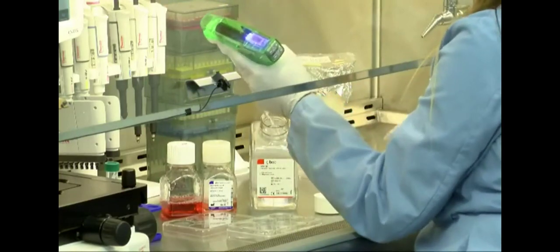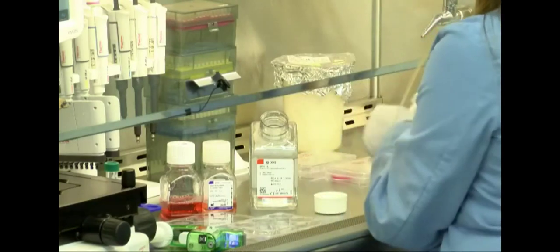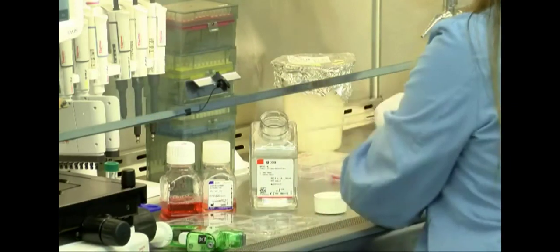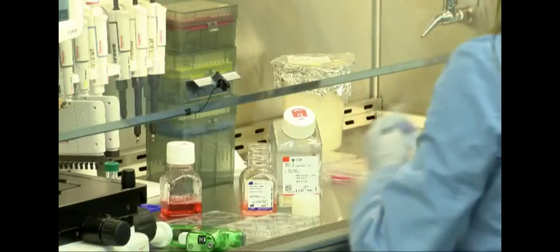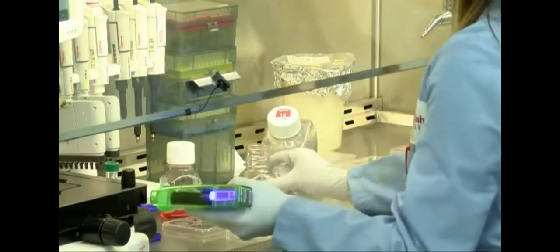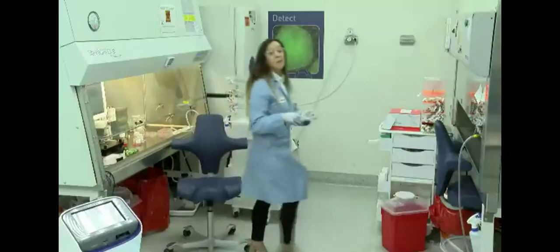And then you're going to add 1 mL per 6 well of your PBS minus minus. And then we are going to aspirate that off again. And then now we're going to add 1 mL of our StemPro Accutase cell dissociation reagent. So we actually use StemPro Accutase because we want to singularize the cells. So once we add the Accutase on, this is actually going to go in the incubator and incubate at 37 degrees for about 5 to 8 minutes.